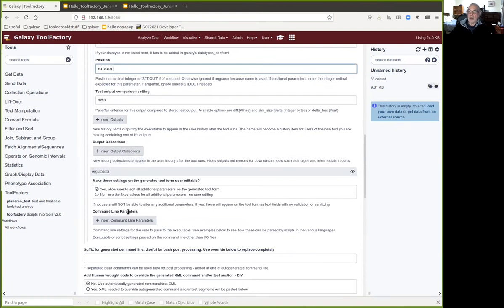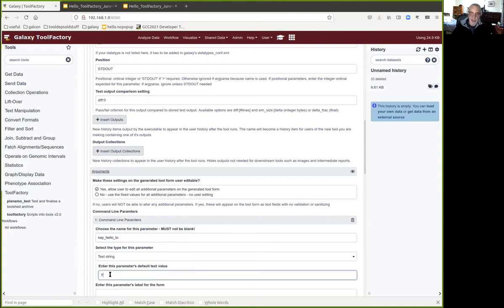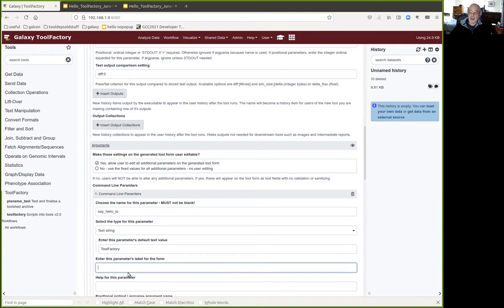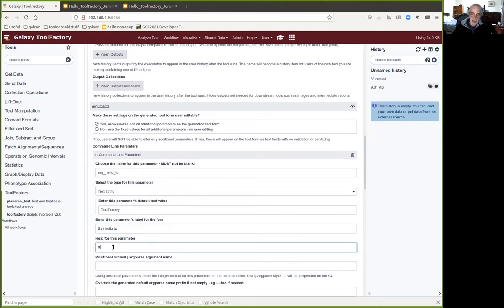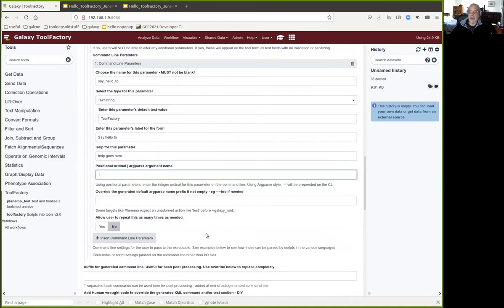We need one command line parameter that the user can set — we'll call it 'hello_to', it will be a text string, and its default value will be 'tool factory'. The user will need some information about this parameter, so we'll put a label on the form saying 'hello to', and help text goes there if the user needs any. The positional parameter will be position one, because we want this to be $1 in the script.